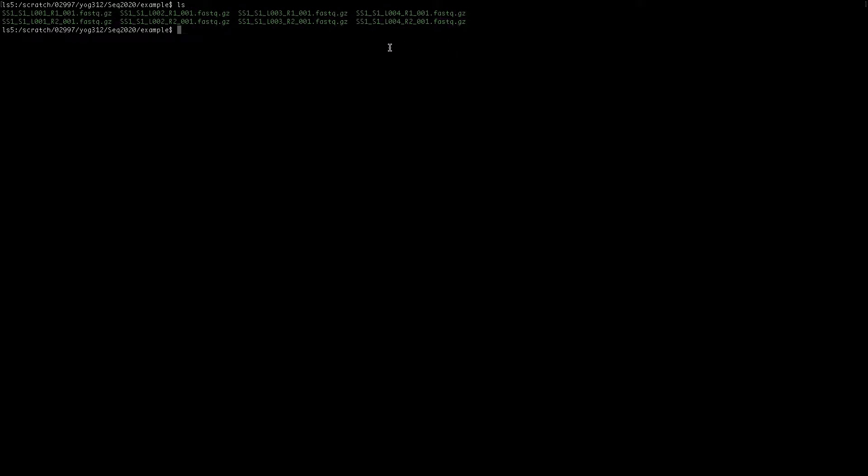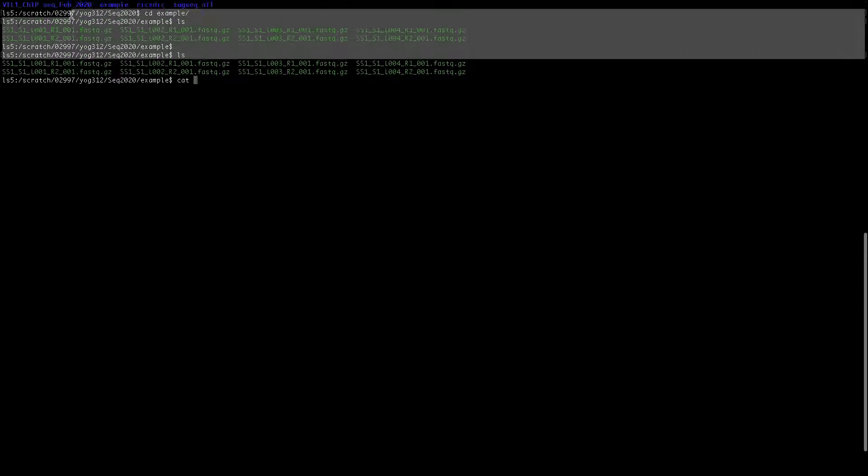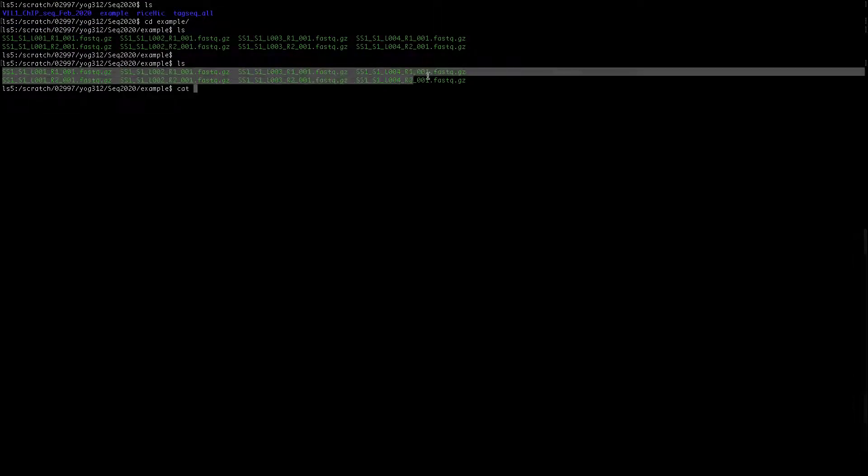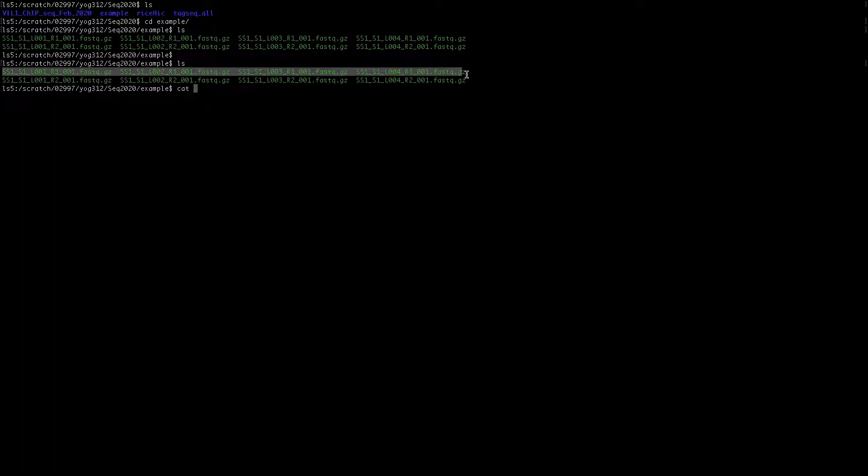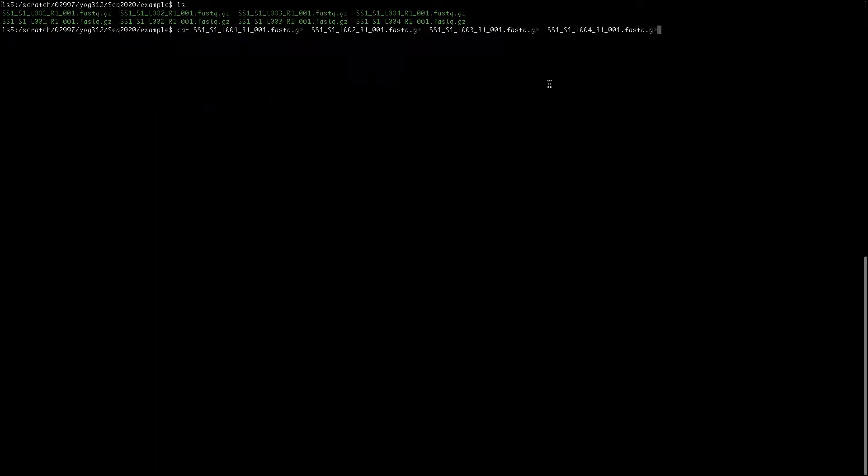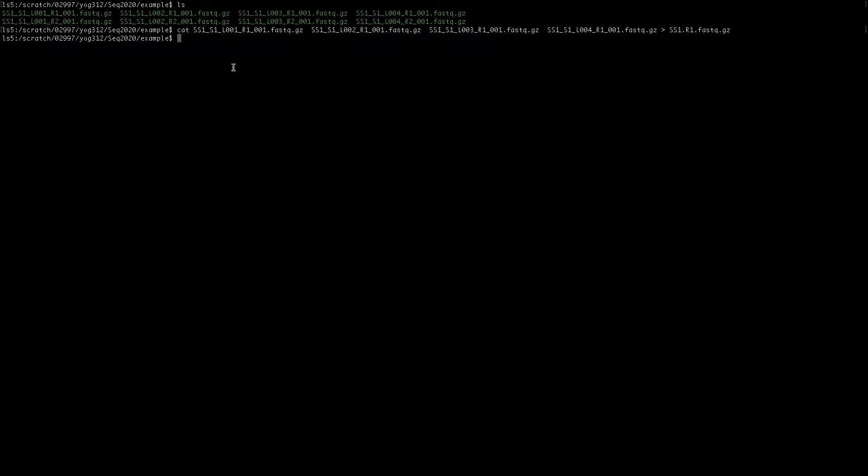For that, what you need to do is cat, that stands for concatenate, and then you copy these files and assign here to create the new file. I'll name it as SS1.r1, for read 1, dot fastq.gz. Press enter and that should combine all four r1 files. If you press ls, you can see now you have one SS1 r1 FASTQ file.